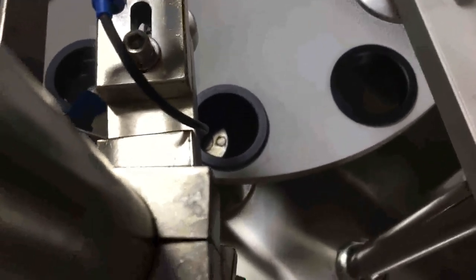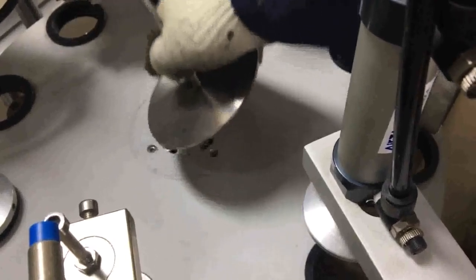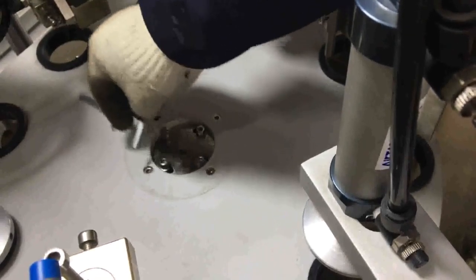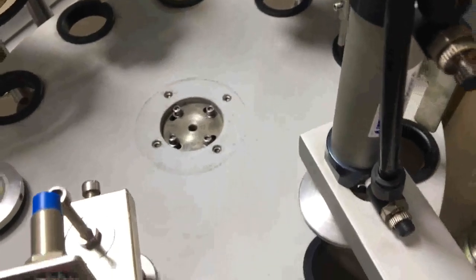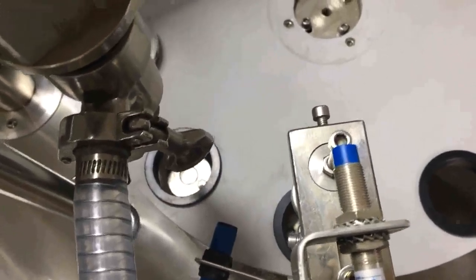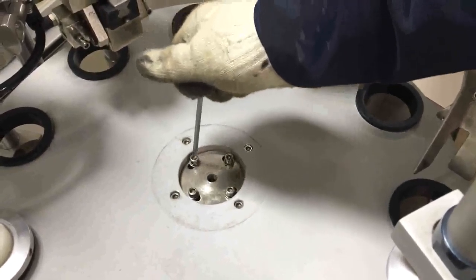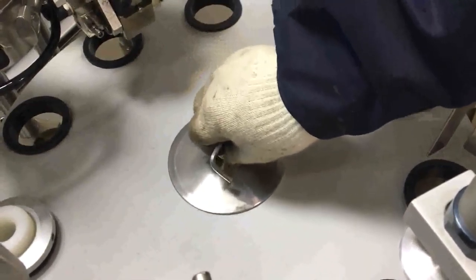If the injection rod is not at the center of the station, loosen the screw of the clamp and also loosen the force screw so the plant can move. Move the plant to make sure that the injection rod is in the middle of the station, and all stations are centered. Then lock the screws.